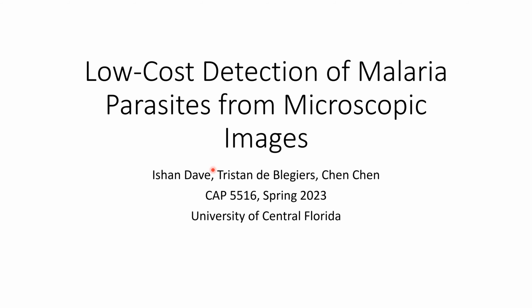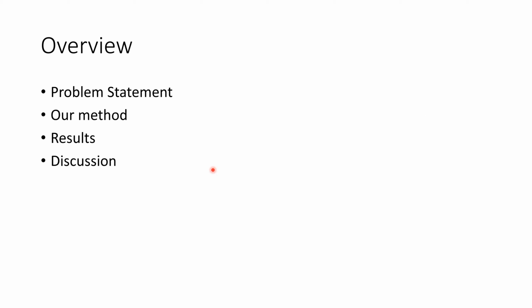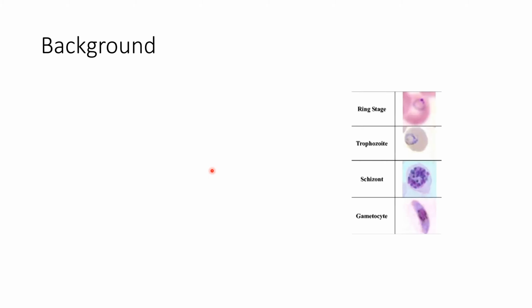Okay, so our project is focusing on malaria detection, and we are working with biomedical cell images. The focus is around detecting malaria at early stages, and also performing it on a special type of microscopes, which are what we call low cost. So we'll go back into it. It's the review for presentation.